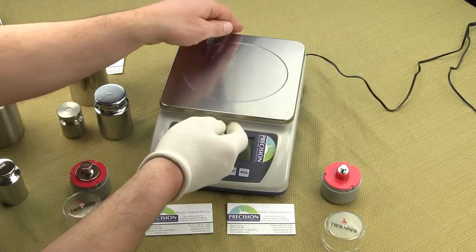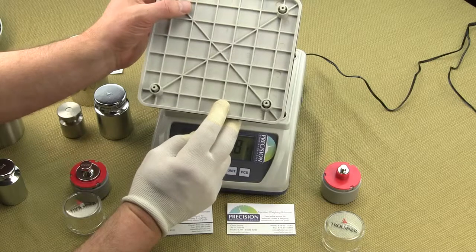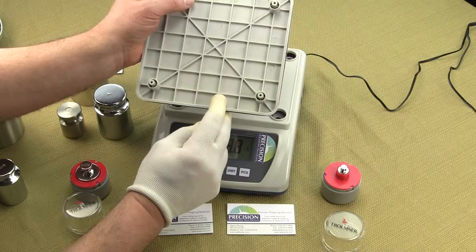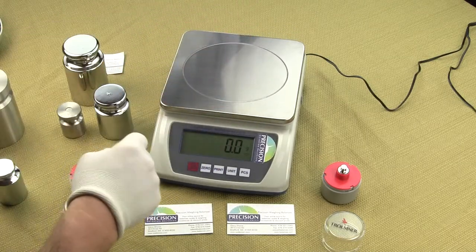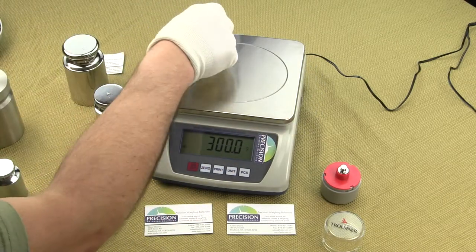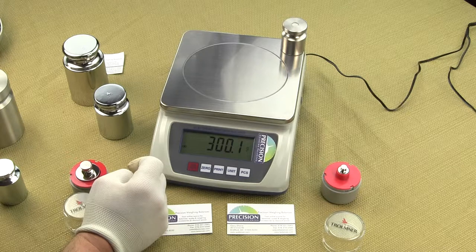The sturdy subplatter sits beneath the stainless steel platter and features a four-post design to provide better weighing results, especially in the corners. Other scale manufacturers design their scales with only a single post in the center, which results in greater eccentric weighing errors. You can determine the eccentricity by placing a weight in all four corners of the balance and noticing the weight difference. With the EPB 10K, it reads to a tenth of a gram in all four corners within spec.